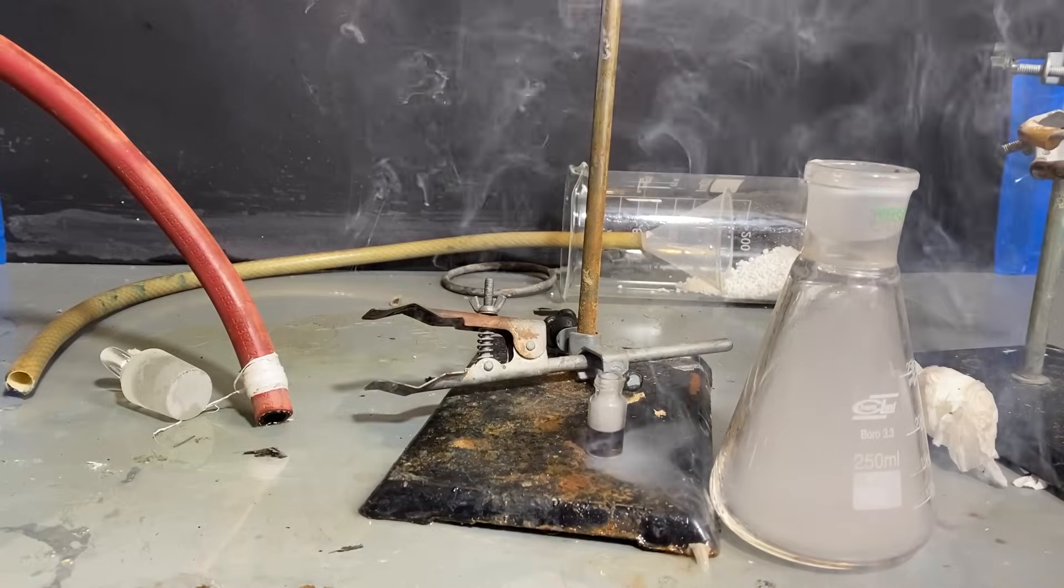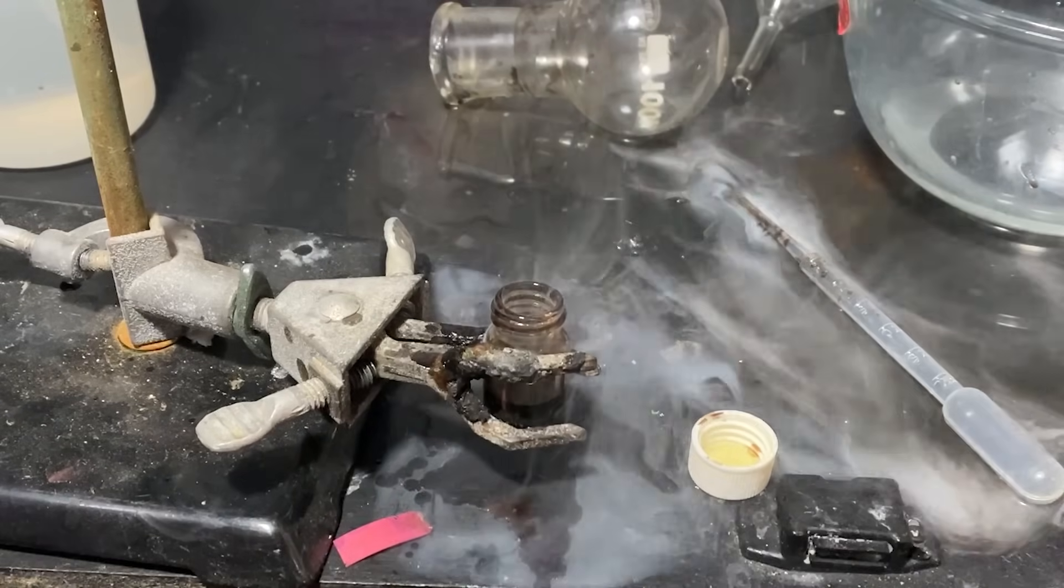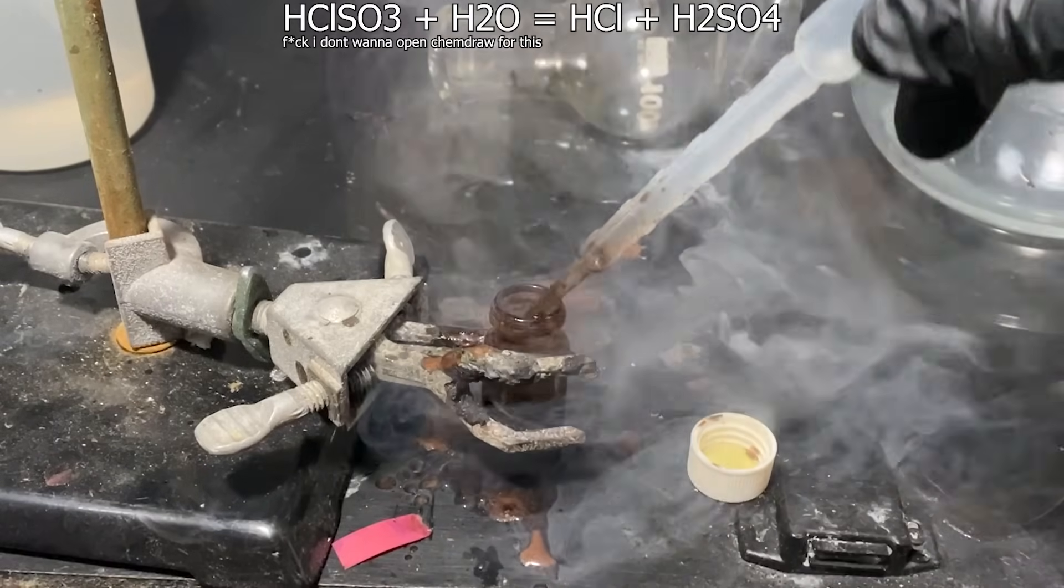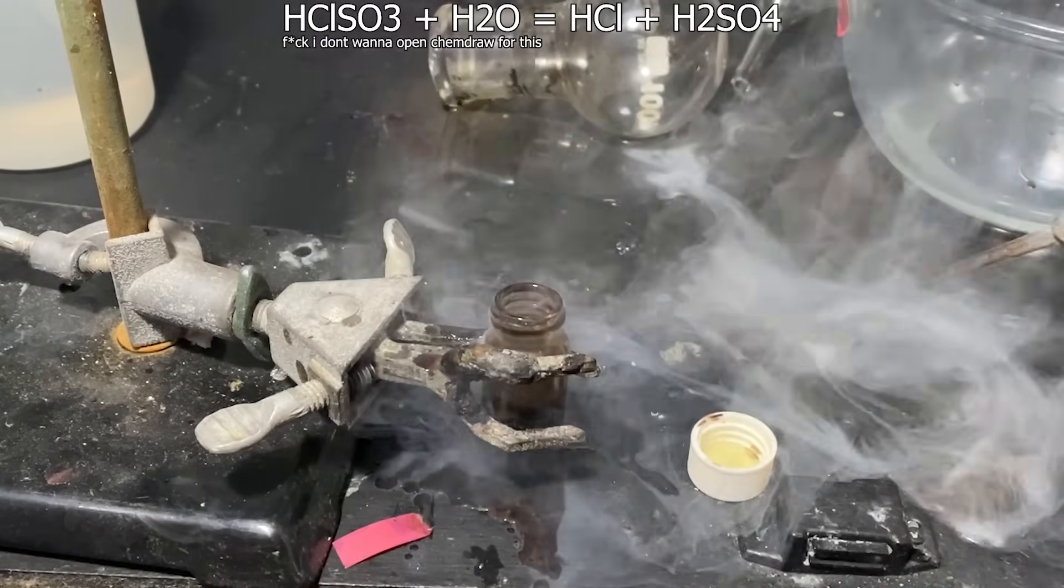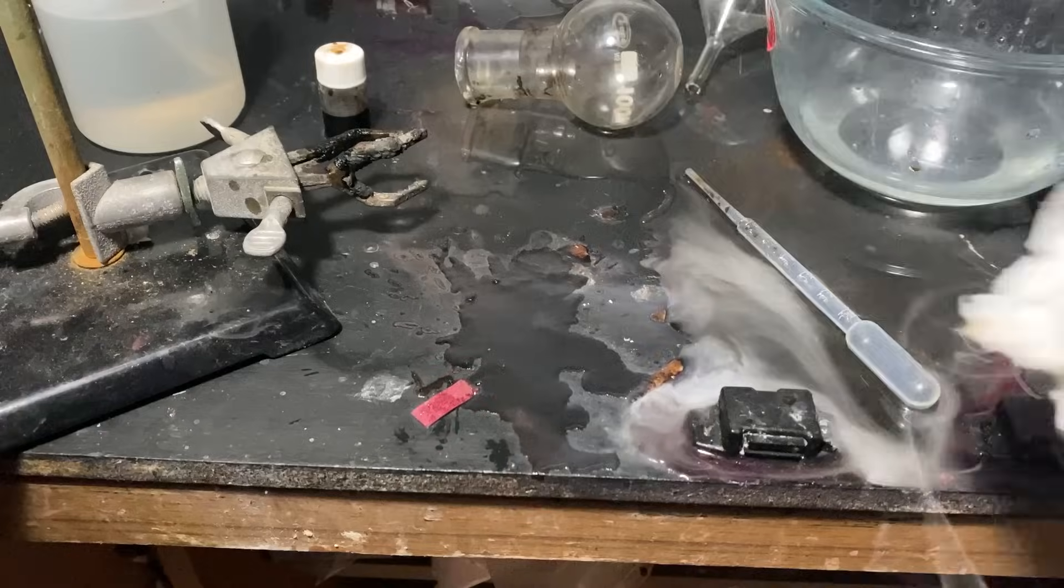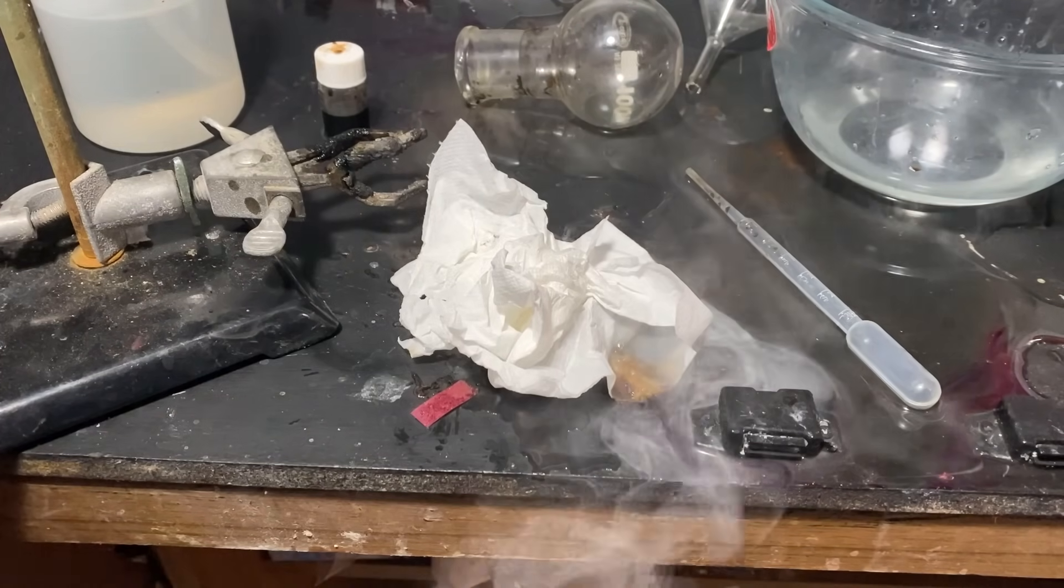And as you may have noticed, the chlorosulfonic acid doesn't take too kindly to water, as immediately it takes the opportunity to hydrolyze and break down into HCl and sulfuric acid, thus my earlier spillage. In fact, this property is so intense that it reacts with even the slightest bit of moisture in the air to form hydrochloric and sulfuric acids, which is why the mist is so thick here.